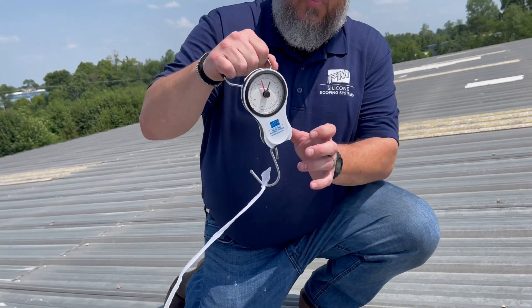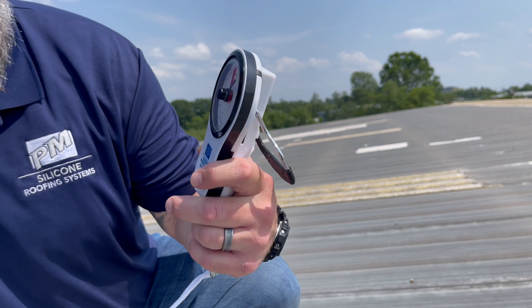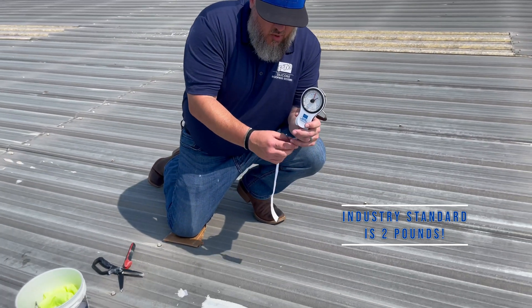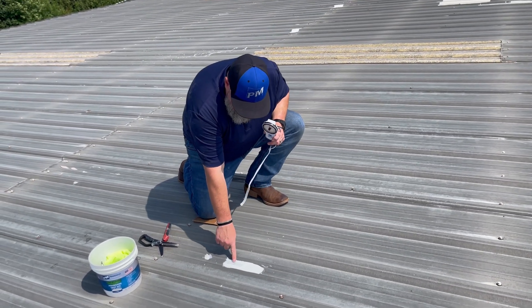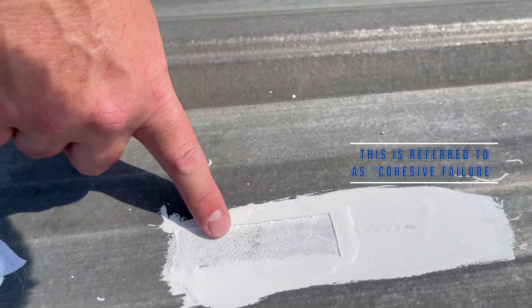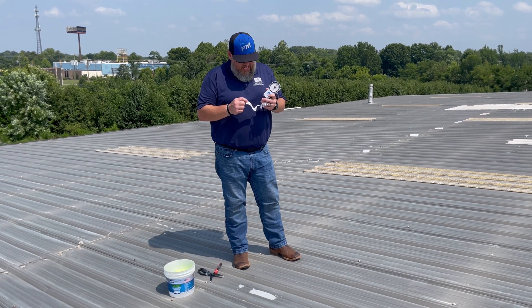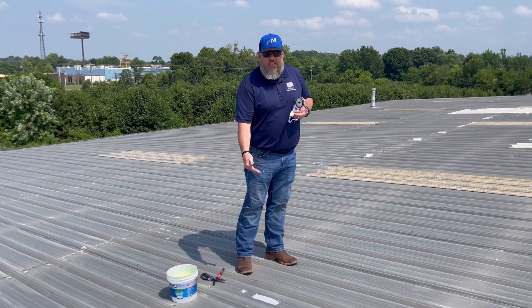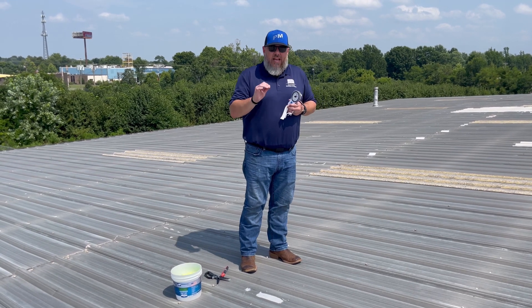We got about nine pounds of pull there. Industry standard is going to be two pounds of pull, so you only need two pounds — we got nine. And what we want to see is silicone left on the roof. This is a pass no matter what the weight. So that was a successful adhesion test. Pulled about nine pounds, had cohesive failure there where we still had material on the roof, and the fabric came clean off. That's ideal — that's what we're looking for.